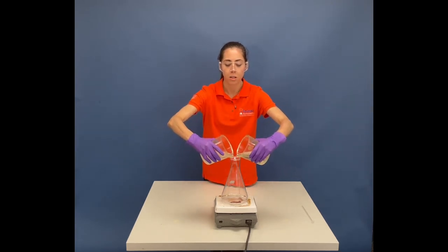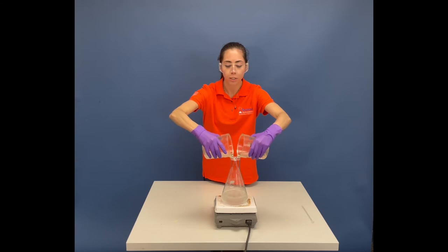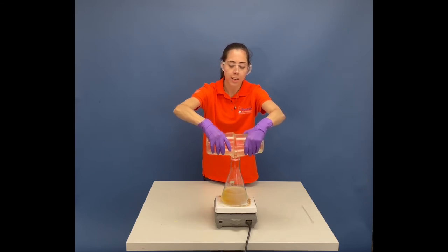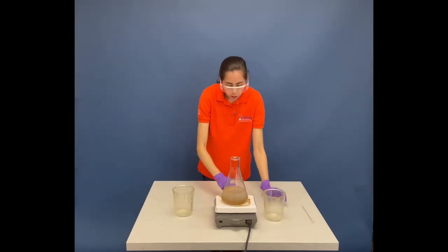I'm just going to do it at the same time, and you're going to see something happen here in a minute. Now, oscillating — you might have heard the word before — is basically just going to be swinging back and forth, and we're going to observe that here as the ions swing back and forth from products to reactants, causing a change in color.